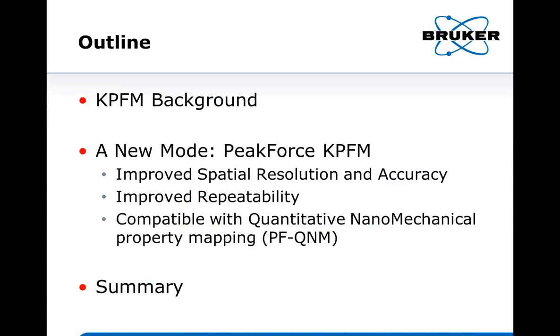The outline of my talk. I'll give a little bit of background on KPFM, Kelvin probe force microscopy, and then I will introduce the new mode, PeakForce KPFM. For this mode, I want to talk about the improved spatial resolution and its accuracy, and the improved repeatability. The reason behind it is we want to make this mode quantitative. Another benefit of this new mode is that it's combined with the PeakForce tapping mode, quantitative nanomechanical property mapping capability we have. And in the end, I will summarize.